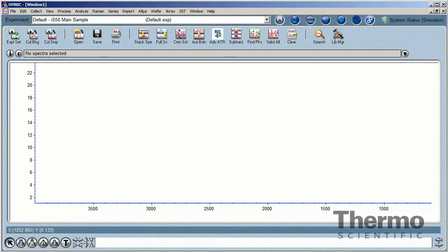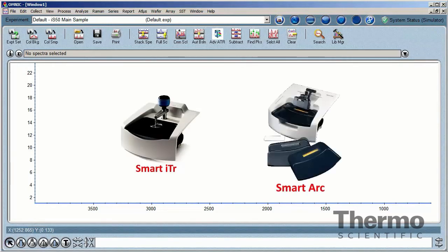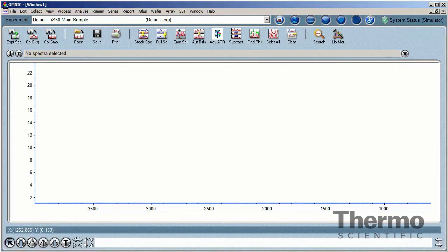The Attenuated Total Reflection technique, ATR, is a simple accessory and offers many advantages. The popularity of this approach has caused a large variety of accessories to become available that are configured to address different sampling needs. Two categories of these accessories are single-bounce and multi-bounce designs. These can be further categorized as either optimized for liquid or solid samples. The ATR experiment is not suited for gas analysis.